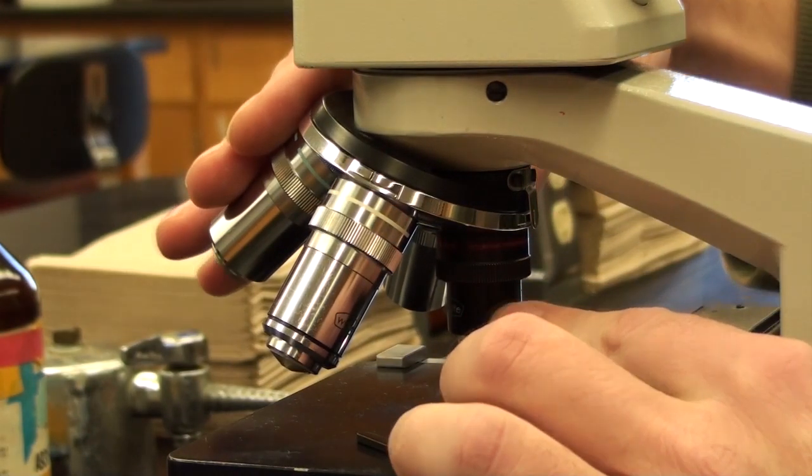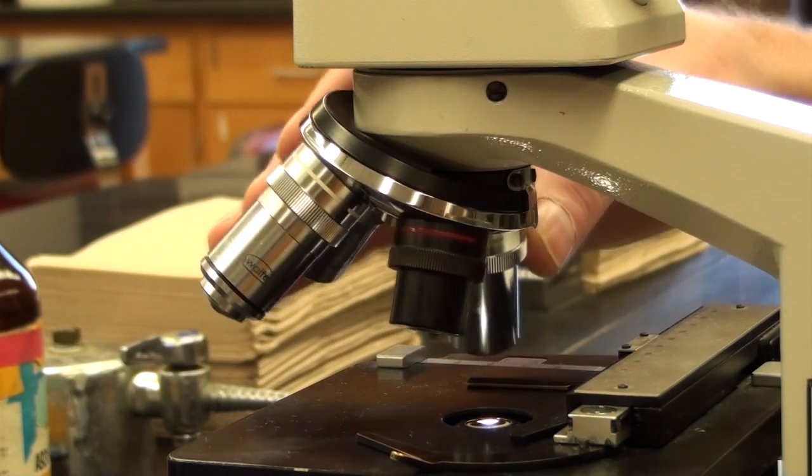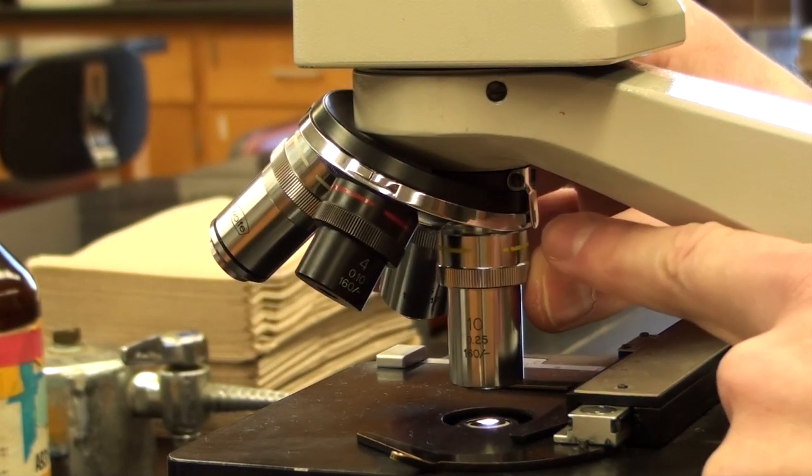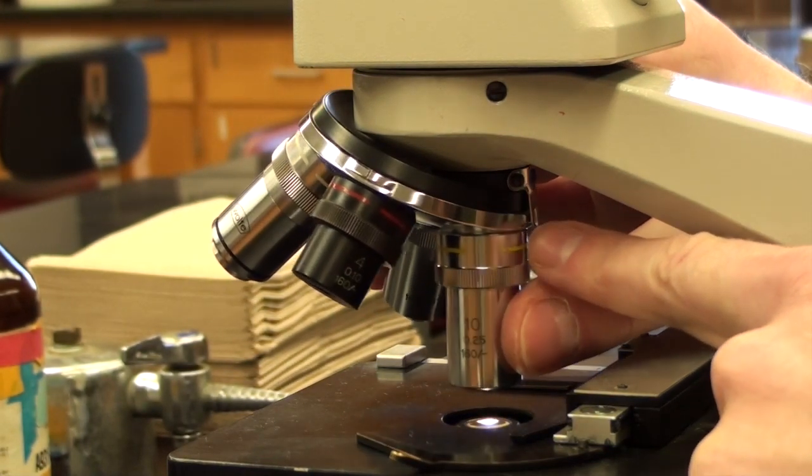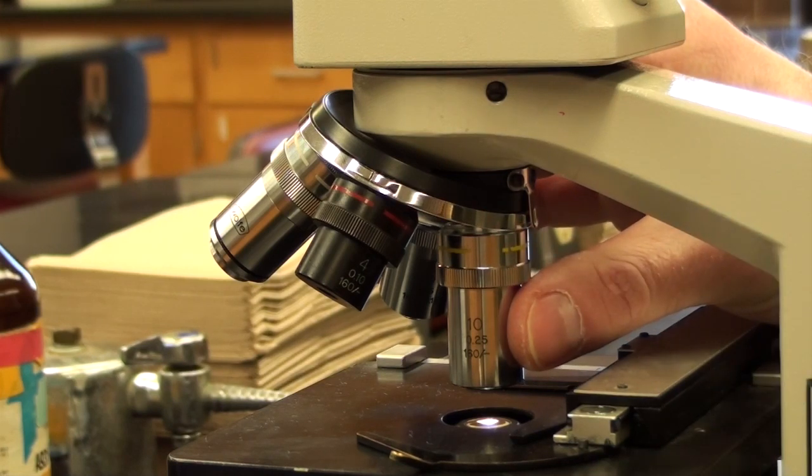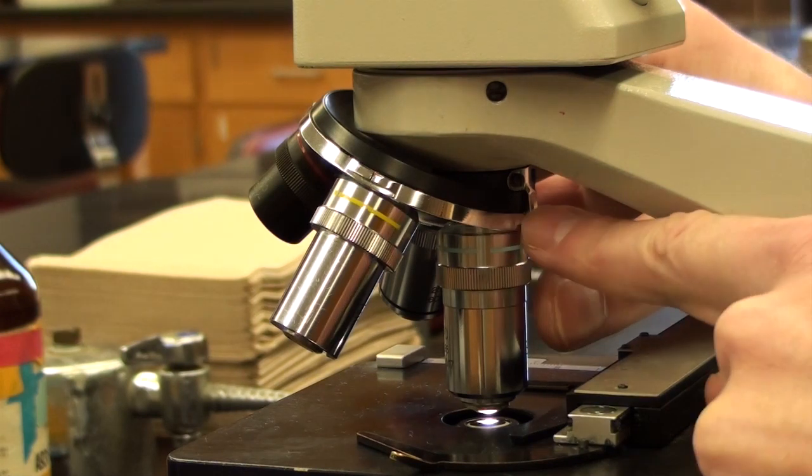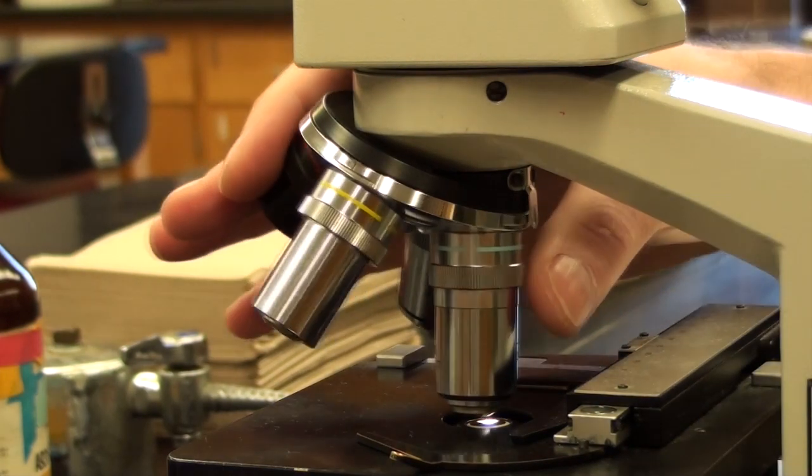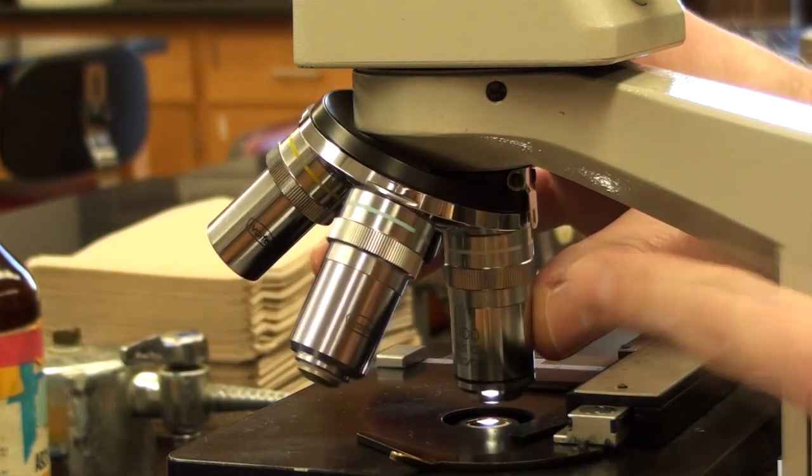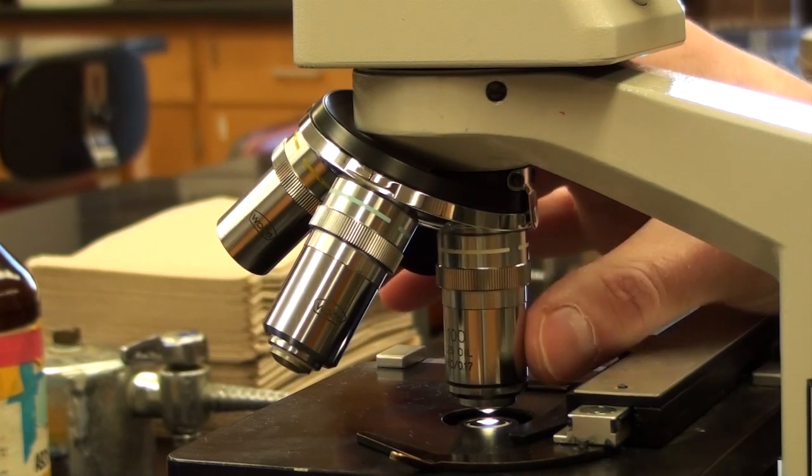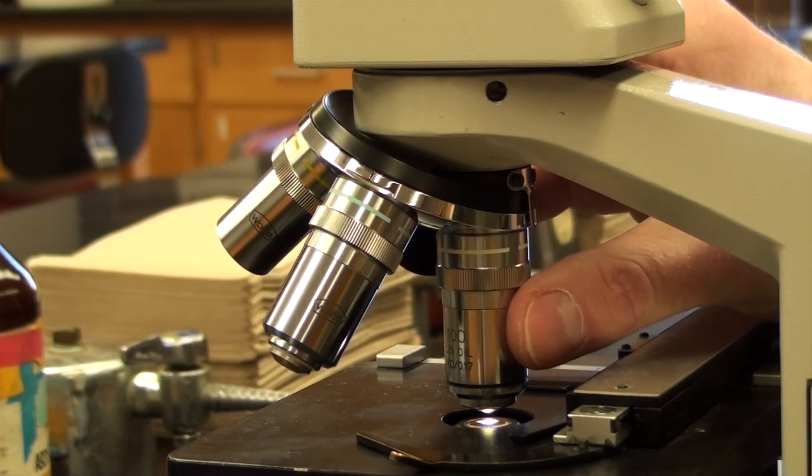Here are our objective lenses. This is 4 power. We'll rotate it in a clockwise direction. Notice right here it should click in. This is a 10 power lens. Then we'll have a 40 power lens. And then last but not least is what we call an oil immersion lens, and this is 100 times power.